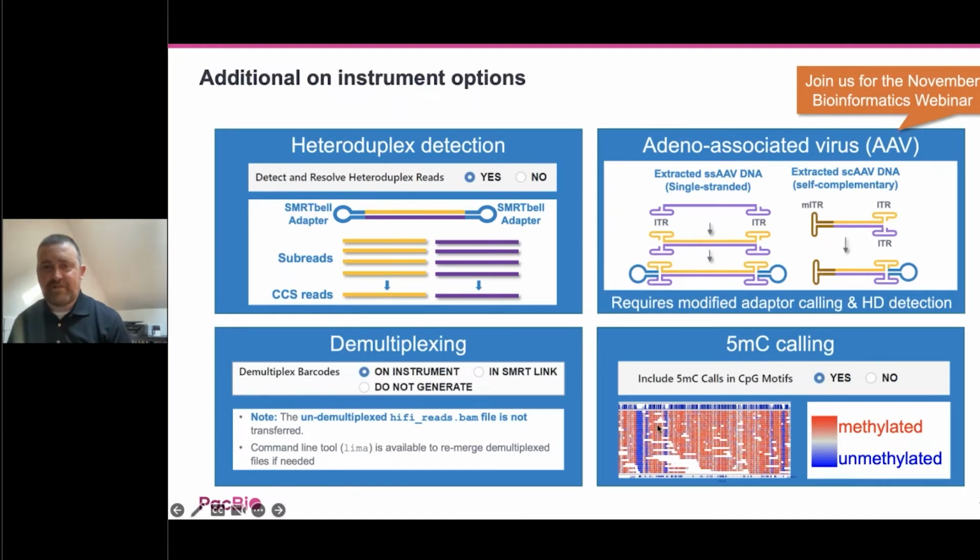This is just a preview where we see a bunch of reads here, and you can already see highlighted in red the methylated positions and in blue the unmethylated positions in these reads. So you can really see these stacking up at certain parts, but I'll leave that for Aaron.